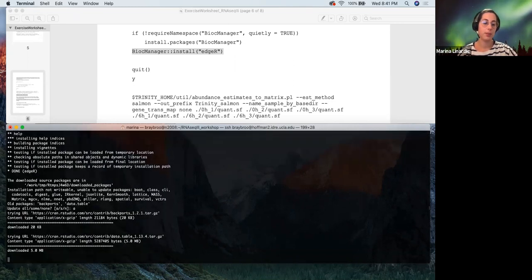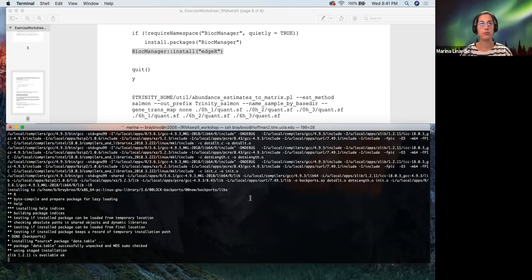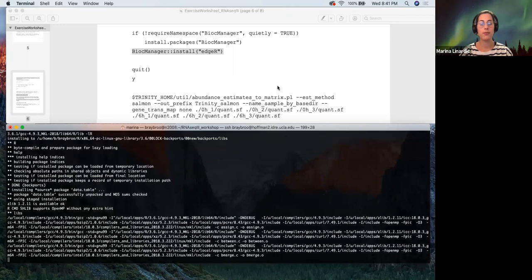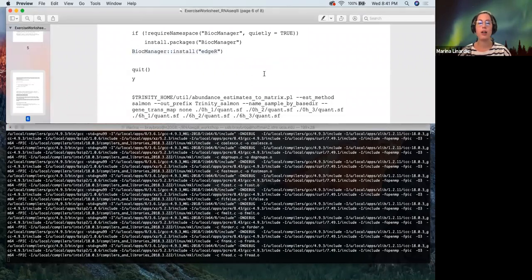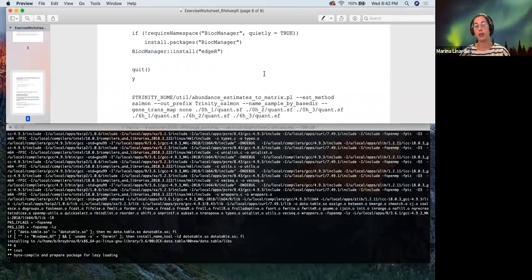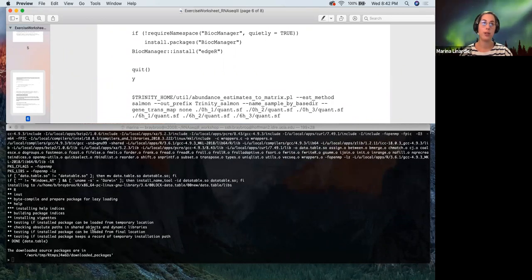Oh, we need to update all these. So it's really useful because you can access R and you can get out of R. And if you put a command on the normal terminal, so not inside R, you can feed into it and just do its thing within R, and then come out and output the result for you right there as well. So sometimes it's asking for these extensions. So I pressed A for all, that I want all installed, and this just adds a bit more time to how long it takes to install it properly. But it's done now for me. So when you have this bigger than sign, it means that it's done.